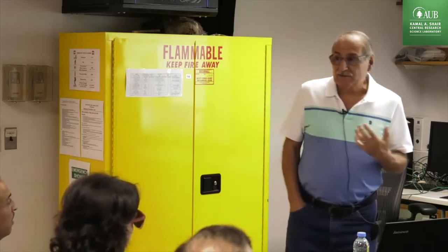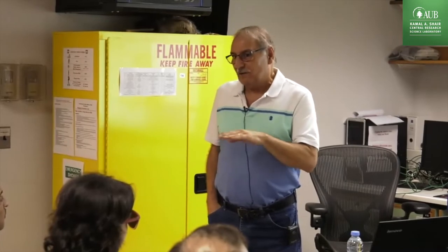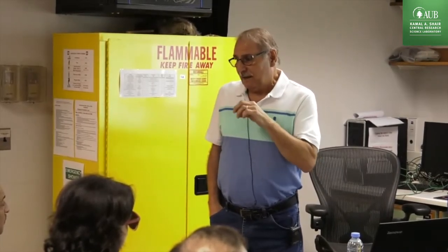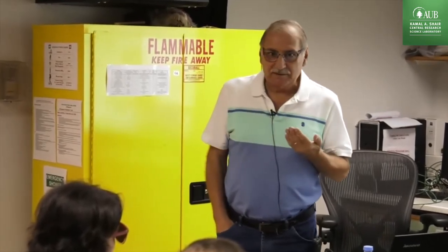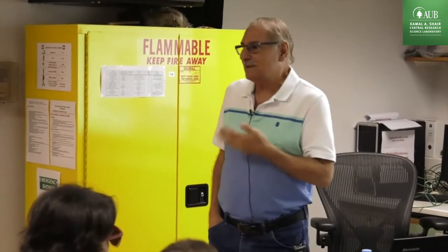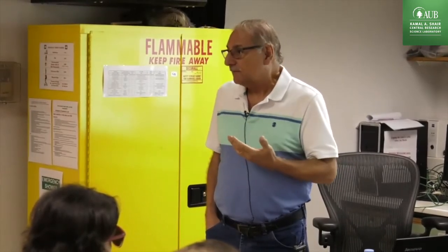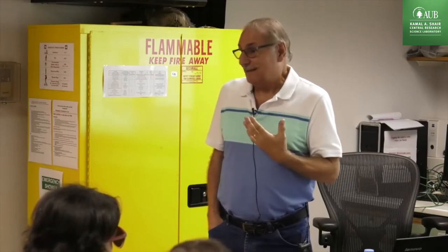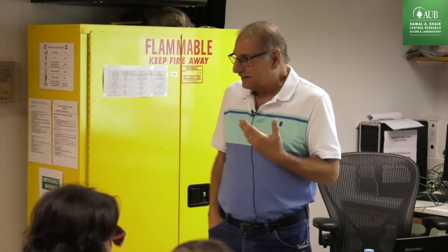The second thing is just to see how many of these active species remain on the surface. This is very important, okay? This is called dispersion of the active species. It's going to tell me... I know how much I put because I prepared my catalyst and I said I want to have 5% by weight, by the weight of the catalyst, of nickel. So I know how much I have. But I don't know where they are. Are they accessible? Are they not accessible?